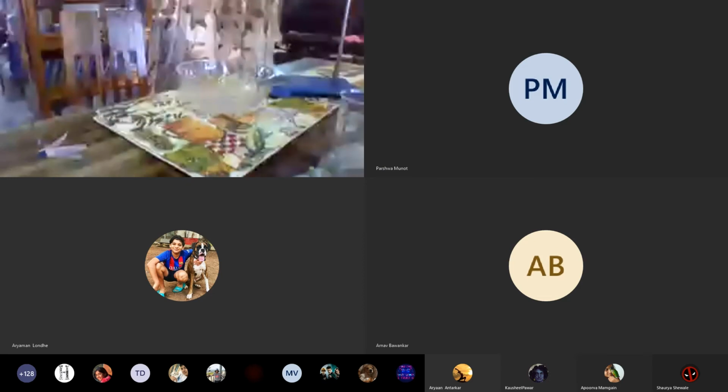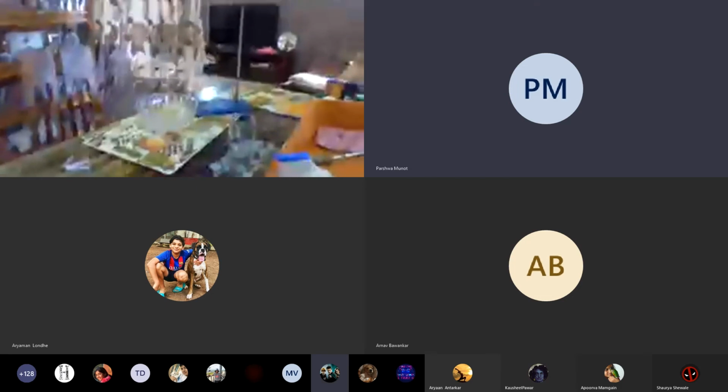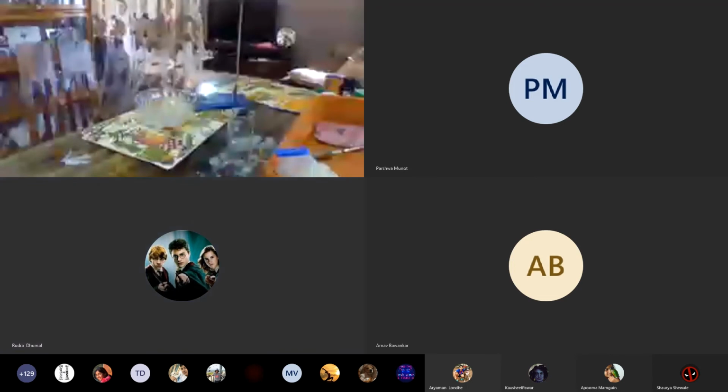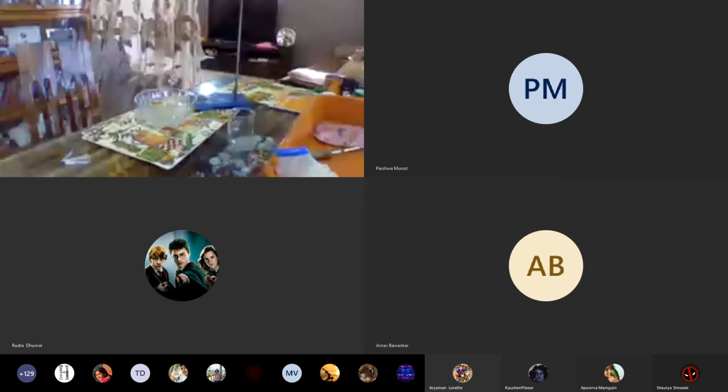Ma'am, we couldn't see it. Your video is blurred, the sparkles aren't visible. You have to stay away because the popping sound is coming. And here hydrogen gas is involved, right?